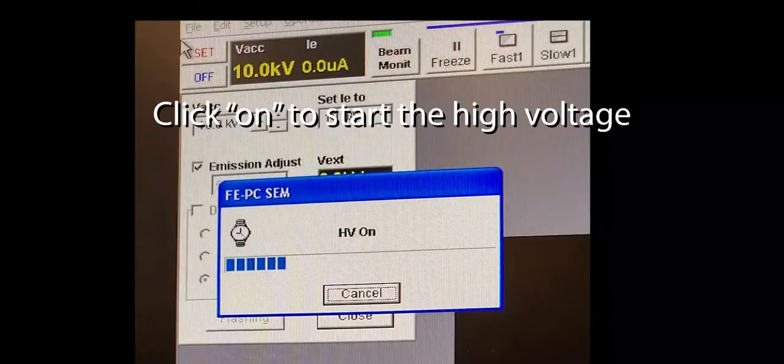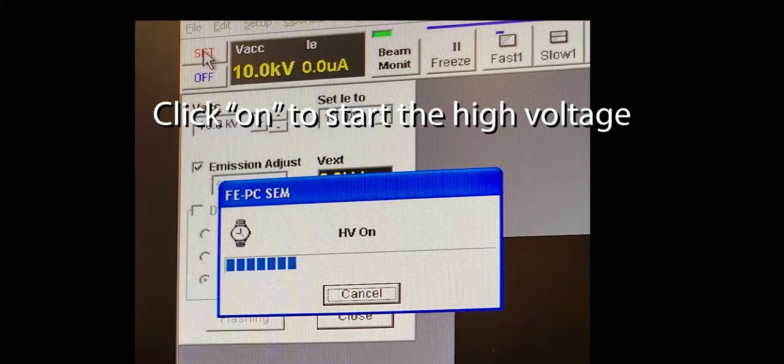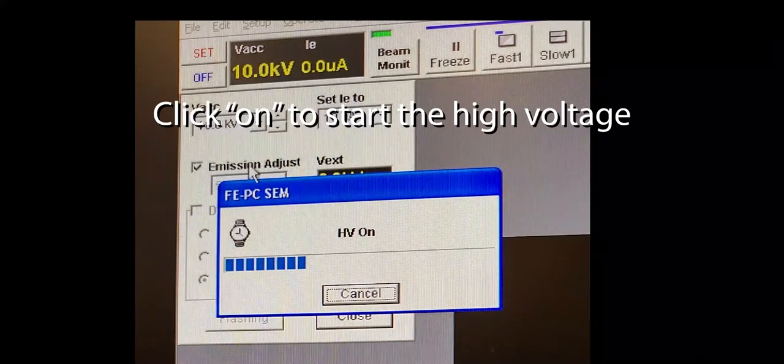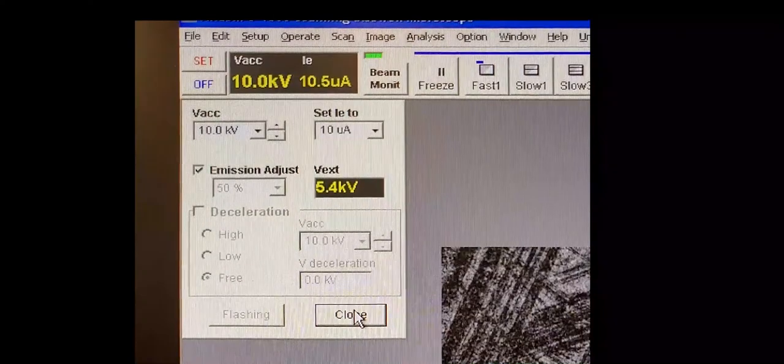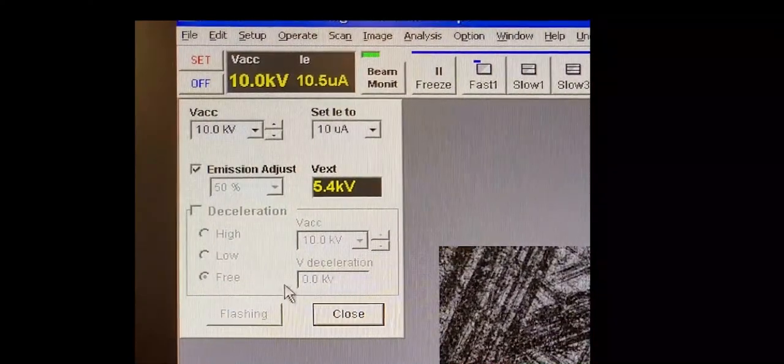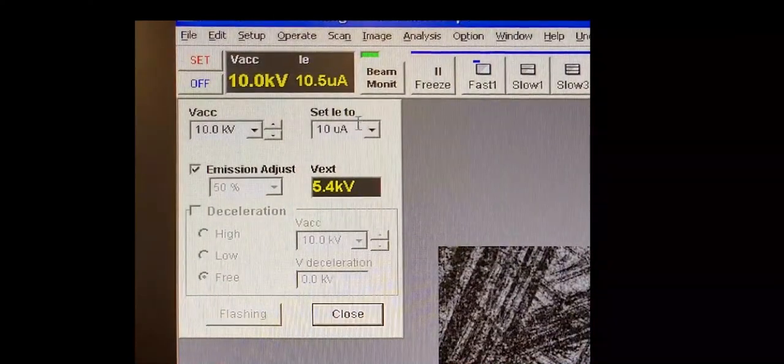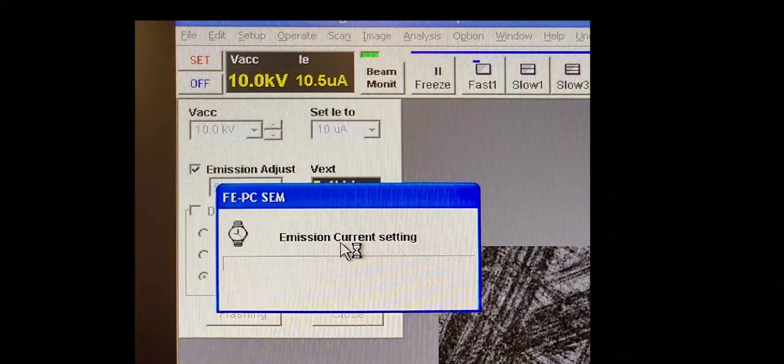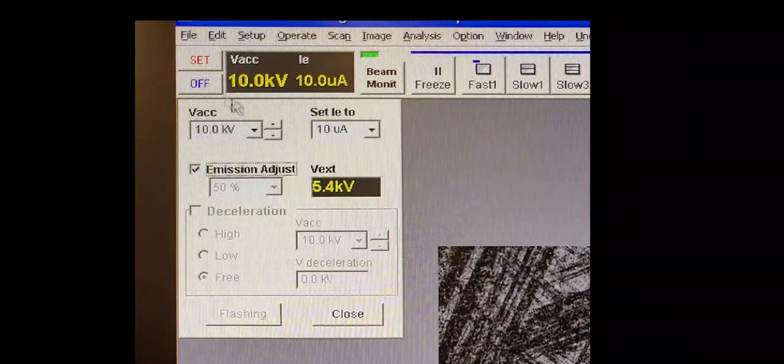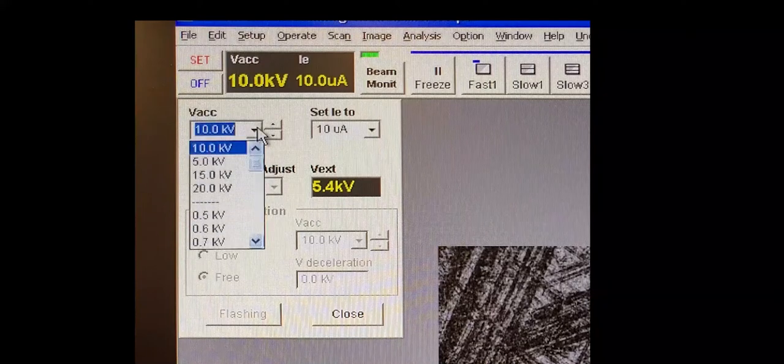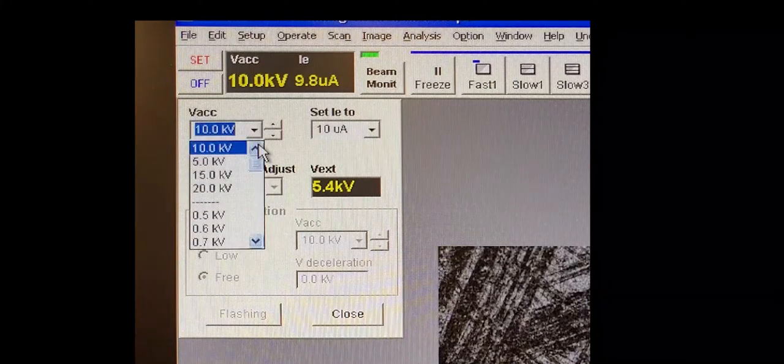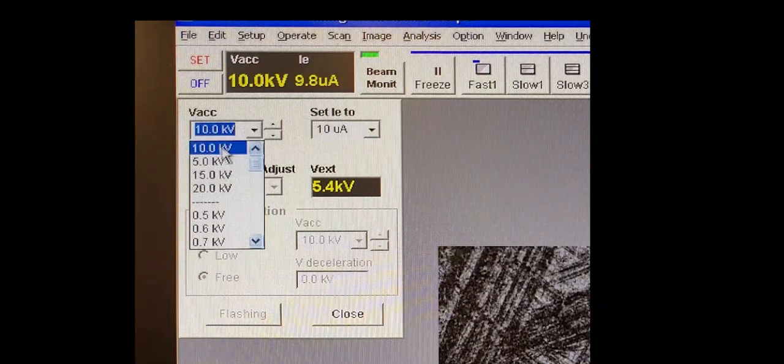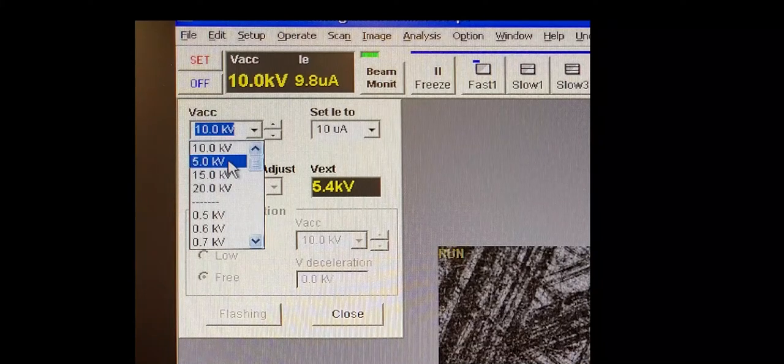So now we're going to wait five minutes and after that time you can then turn on the high voltage in the top left corner. You'll wait for it to load and then you can choose your settings. The current is always set to the default of 10. The accelerating voltage is your choice. For very conductive samples, you can use up to 20. That's our max.